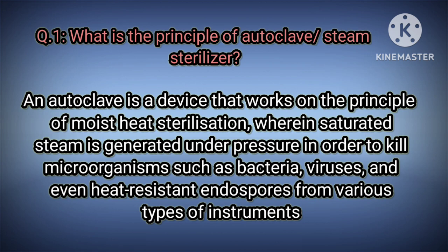What is the principle of autoclave or steam sterilizer? An autoclave is a device that works on the principle of moist heat sterilization, wherein saturated steam is generated under pressure in order to kill microorganisms such as bacteria, viruses, and even heat-resistant endospores from various types of instruments.